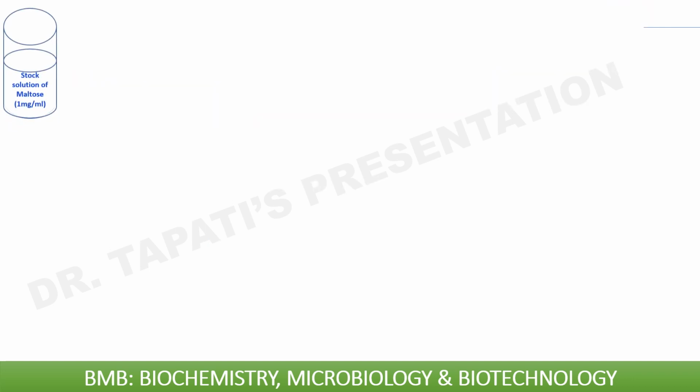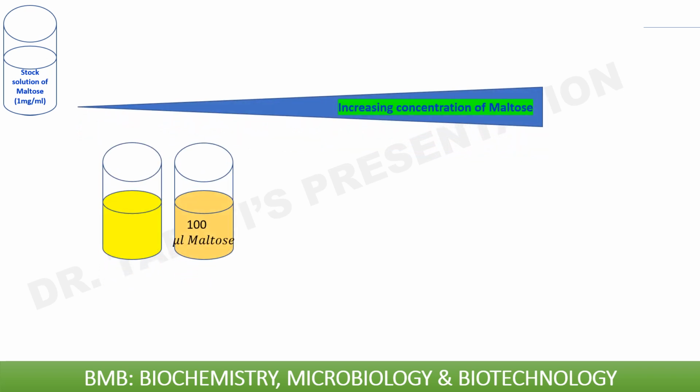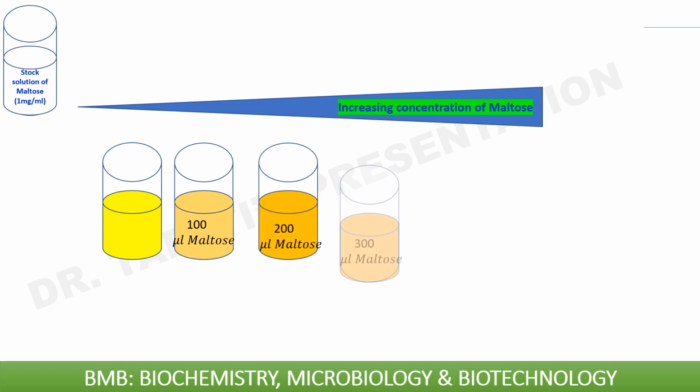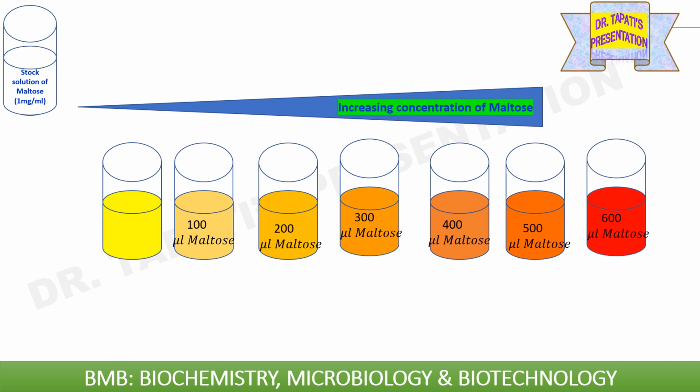If we increase the concentration of maltose in different test tubes from 100 microliter to 600 microliter, we will find almost this type of color trend. Here, if you see carefully, you can see that absorbance will increase if we increase the concentration of maltose.